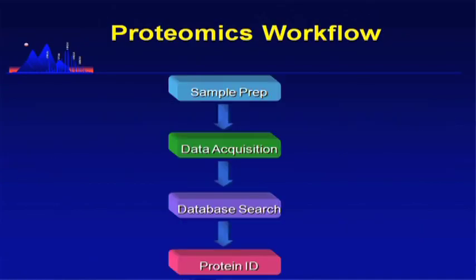Okay, so here, do I have a pointer? Yep. Here's our basic proteomics workflow that I think you've already seen. We're always going to do some level of sample preparation, and there are some key steps here, even though this is going to vary greatly depending on your application. There are some key steps that are going to be common to every proteomics workflow, and we'll talk about those in a little more detail.